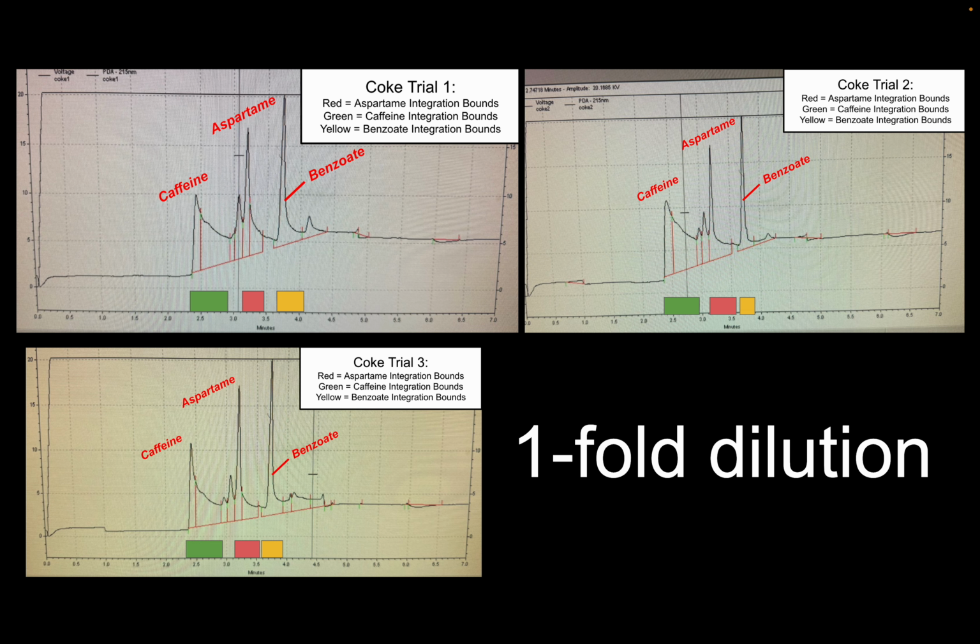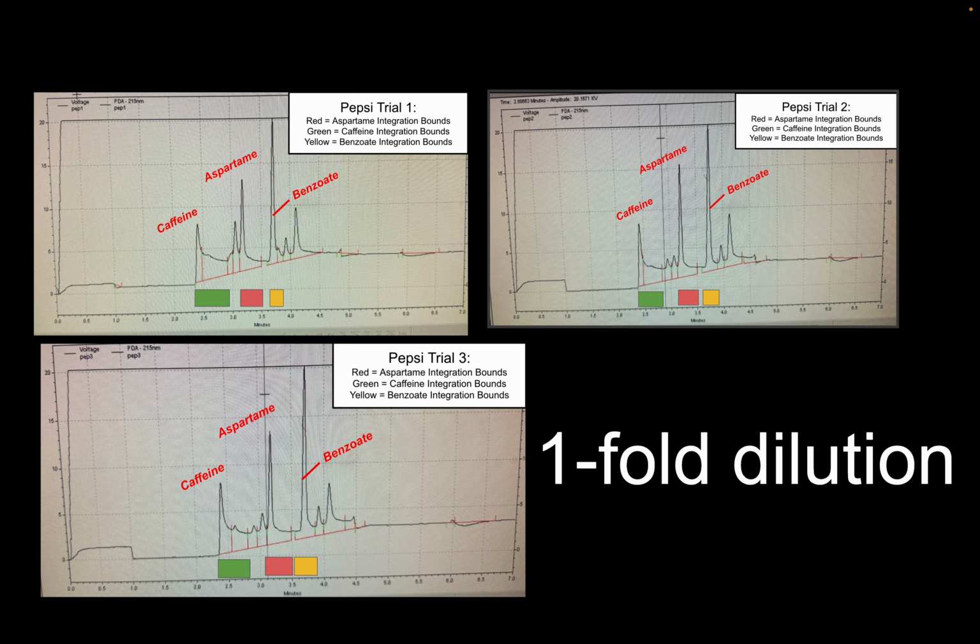And to a significant degree, I think the y-axis there is in voltage, so the voltage is jumping like 5 kilovolt. I think that's what it's measuring. Anywho, the point is that these peaks are not well resolved. They're not great, and in fact, that's what we see for the rest of them. Large tailing, not a great base separation.